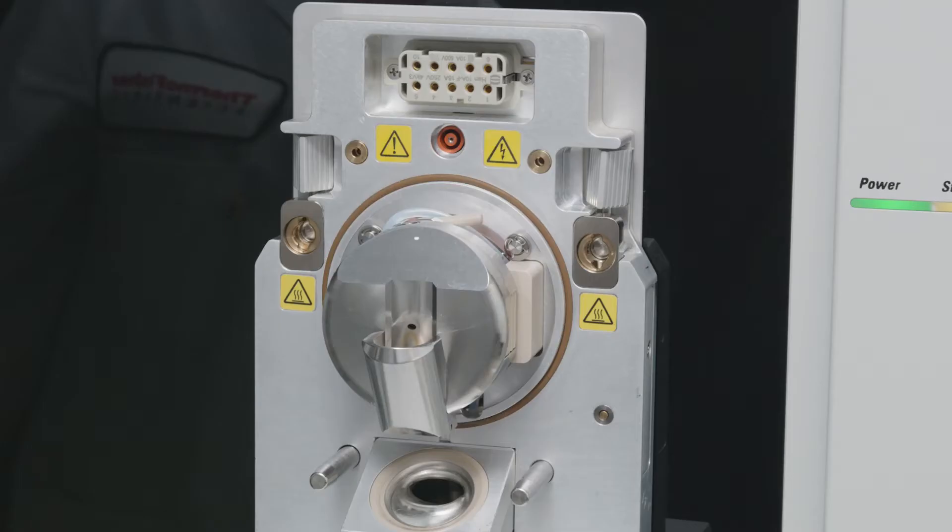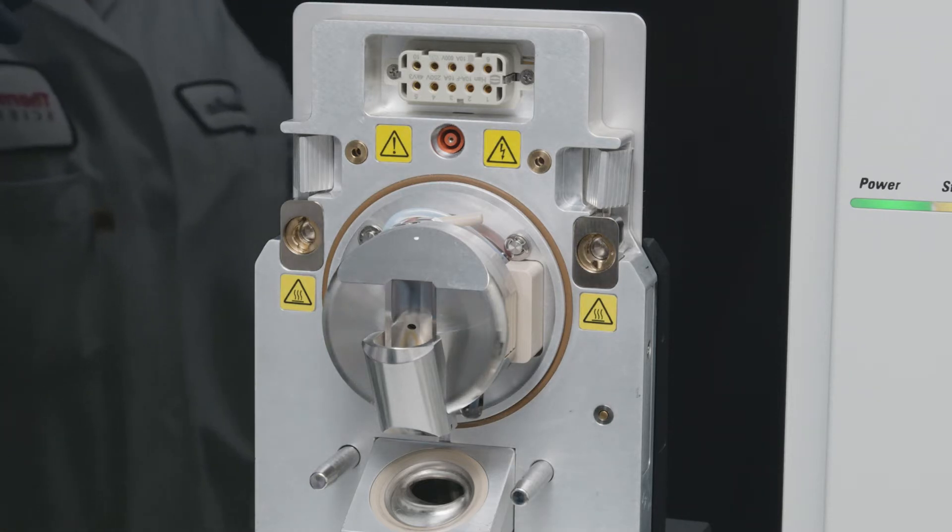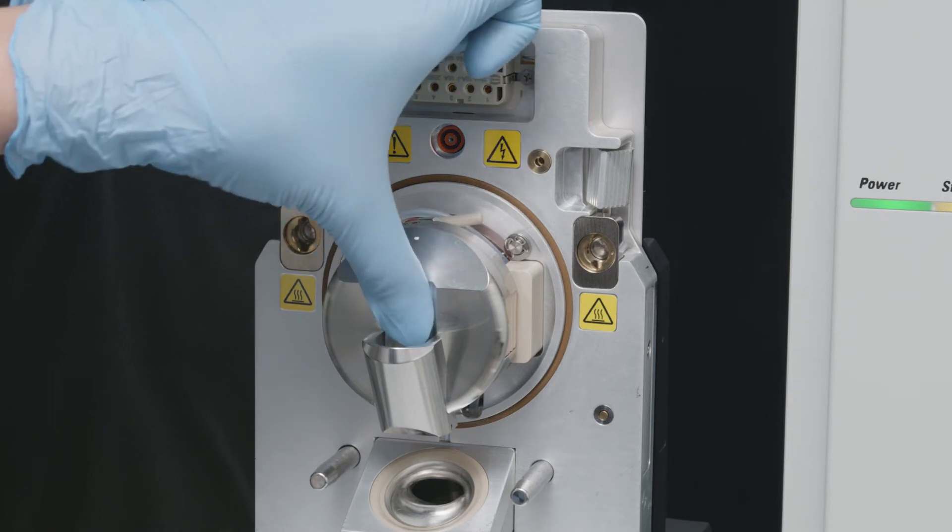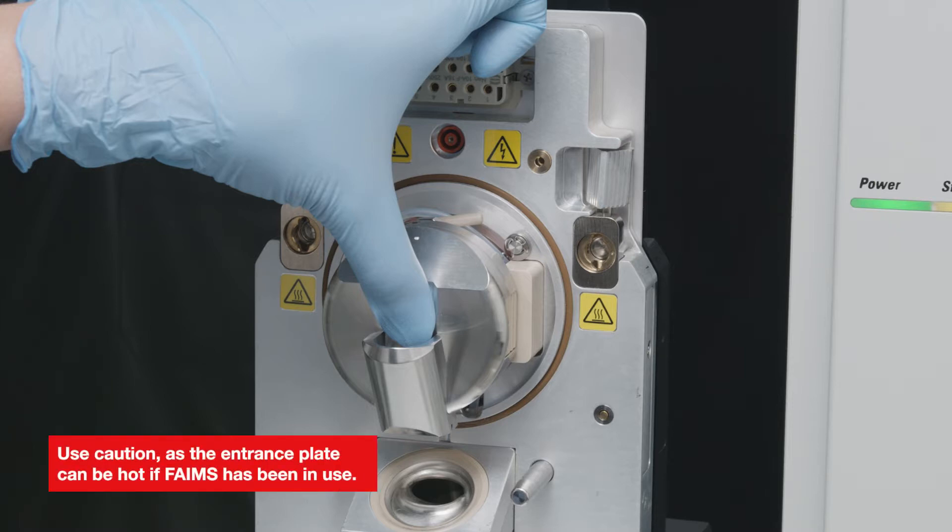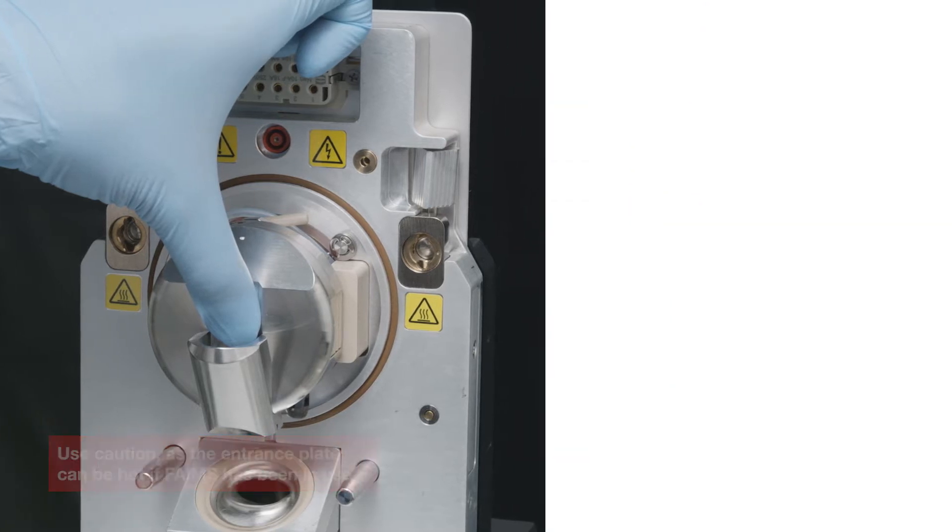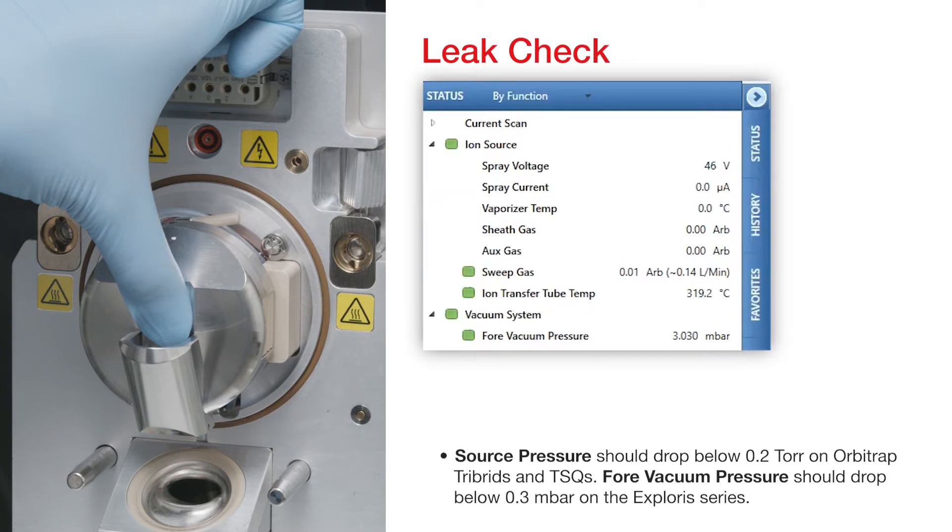Next, perform a leak check to ensure that the electrode assembly is sealed properly, as a leak might impact ion transmission. To do this, place a gloved finger over the orifice on the entrance plate. Use caution, as the entrance plate can be hot if FAIMS has been in use. The source pressure should drop below 0.2 TOR on Orbitrap tribrids and TSQs, or below 0.3 millibar on the Explorus series.